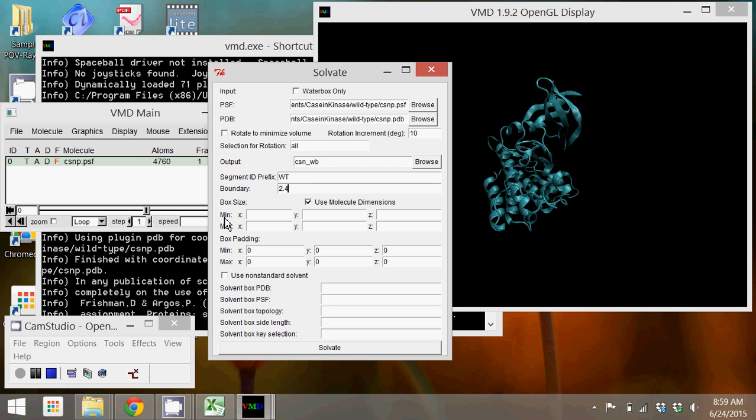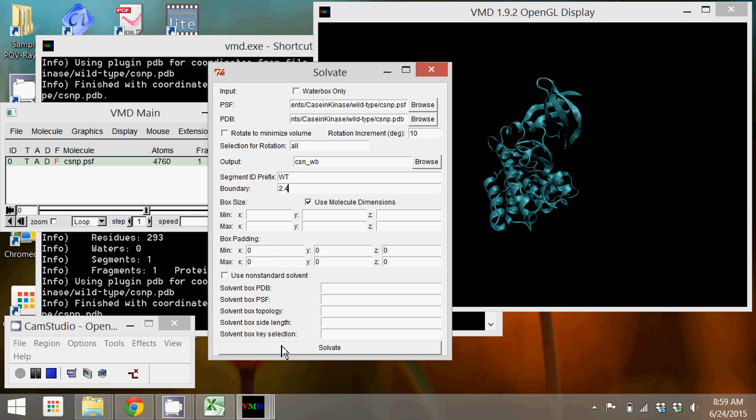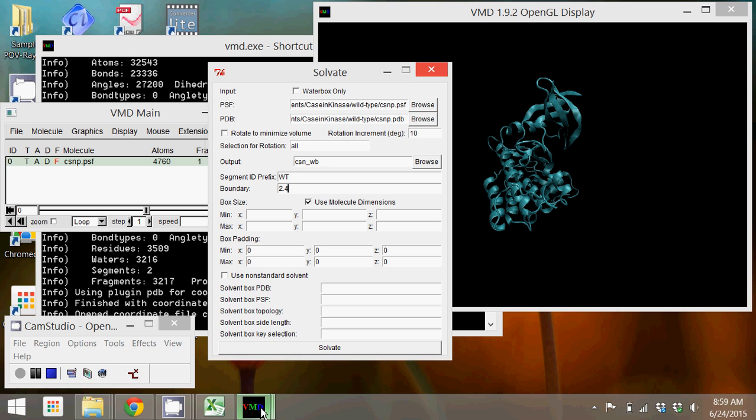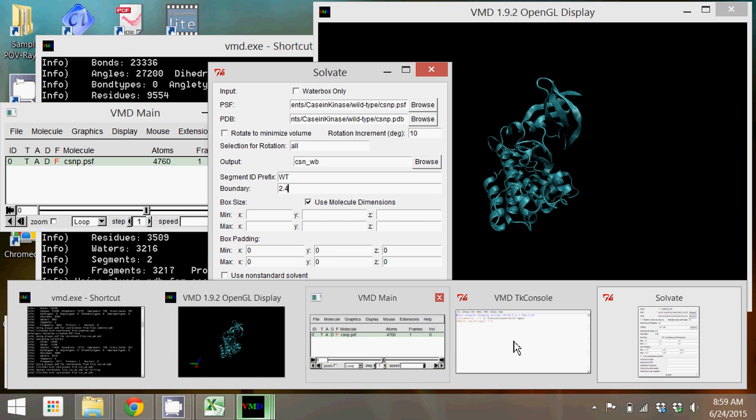You'll see things happening in the window, or if you have your console pulled up you'll see things happening there. And what you're looking for is to get your cursor back at the end with the info here saying that the solvate was completed successfully.